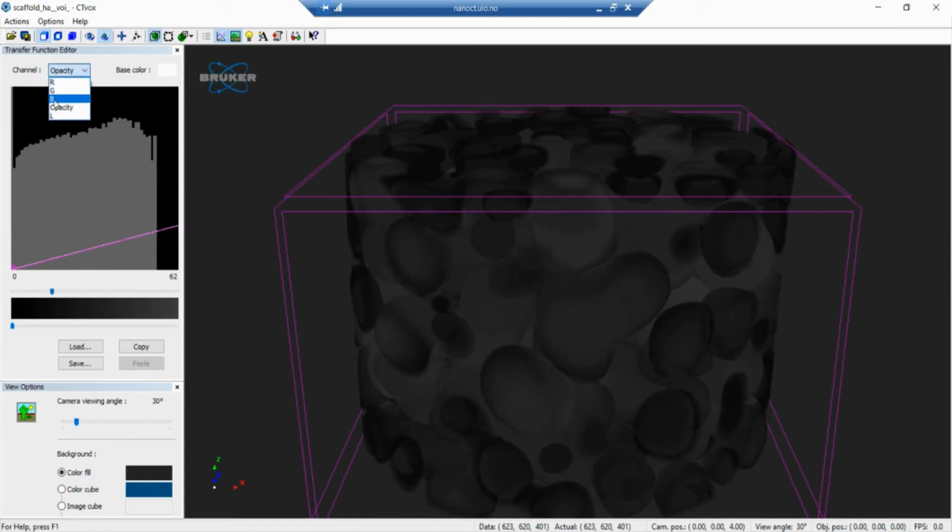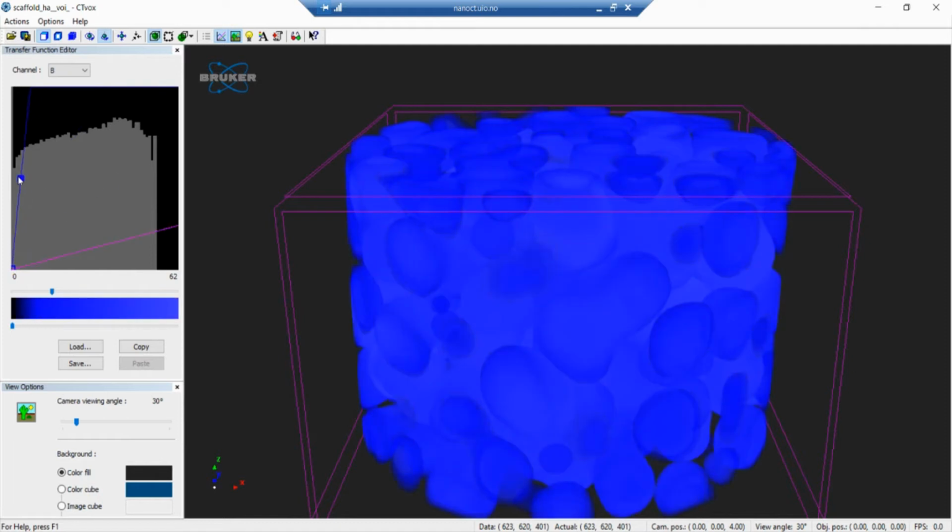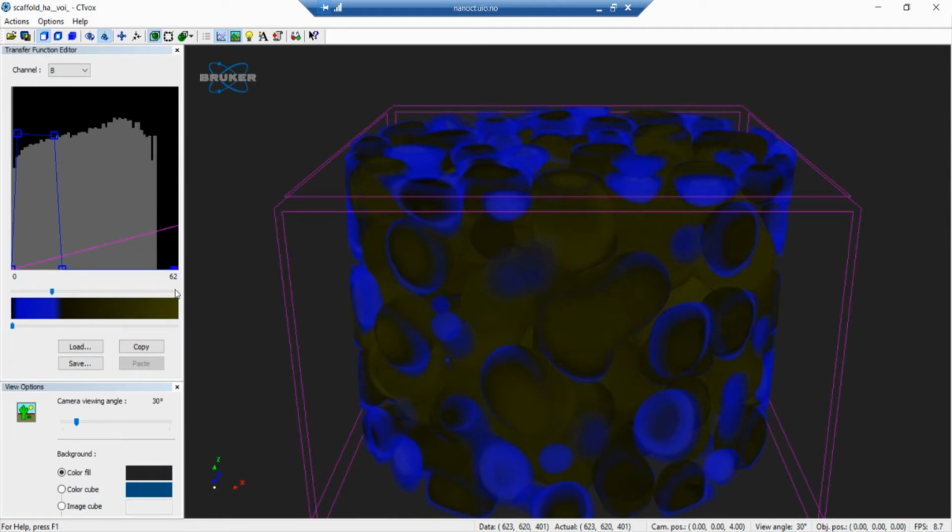And I can play with the colors here and make the blue one the smallest one. So I have to grab like this. Let's try to roughly divide it into 3 parts, just to make it fast.